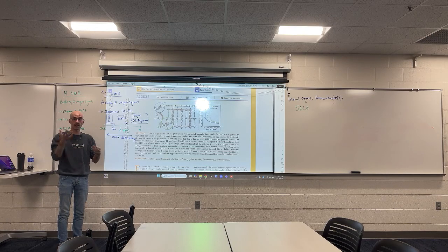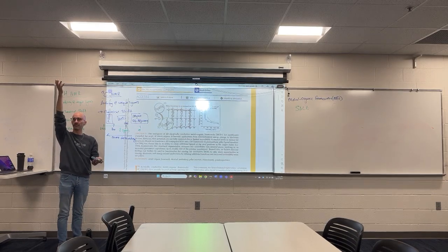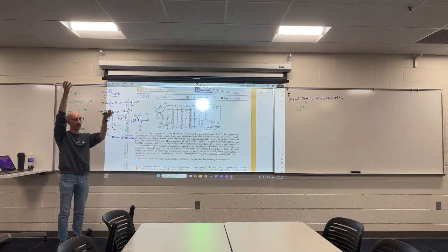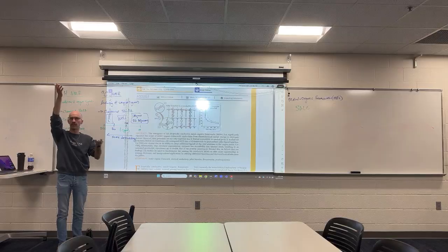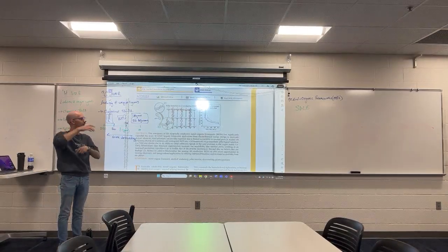And the NMR would give me signals. This is a signal corresponding to the original organic linker, and this is a signal corresponding to the new organic linker. And I could quantify how much of the old was still there and how much of the new was still there by looking for unique hydrogen signals.